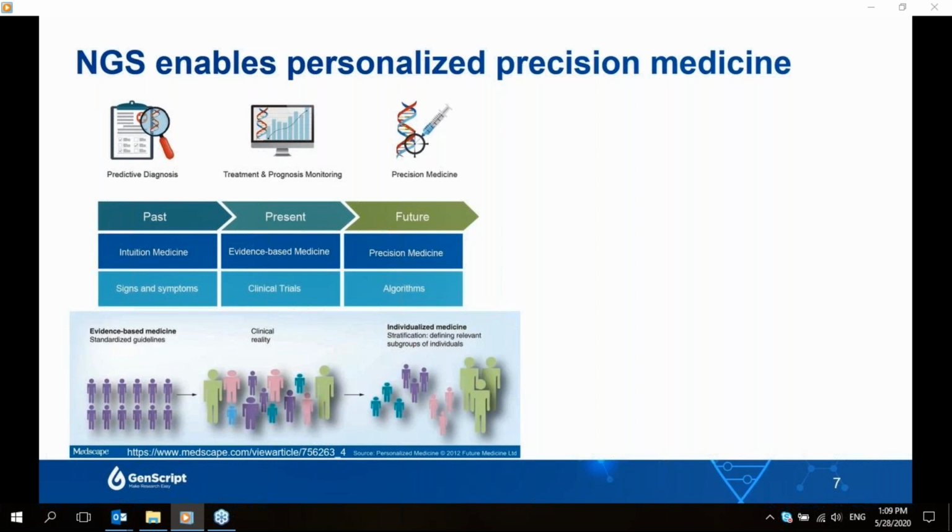So when it comes to mutations and diseases and genetics and diseases, not only does NGS enable detection of harder and rarer mutations, or detecting more deeply, it also provides the possibility of reviewing information more widely, or in other words, it provides a bigger picture of an individual by surveillance of his genome. That's why there's been so much talk about NGS being the basis for precision medicine.